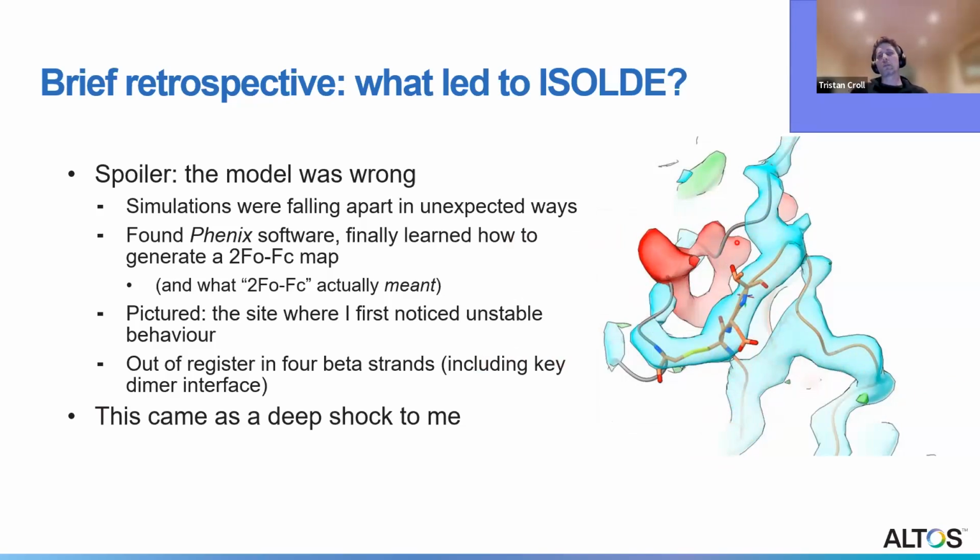And the 2 residues shown here, just to add a little bit of extra complexity, were actually incorrect in sequence. They dated back to the original sequencing of the insulin receptor from 1985 or thereabouts, where these had been annotated as aspartate and threonine when they should be valine and serine. So a few things going on.